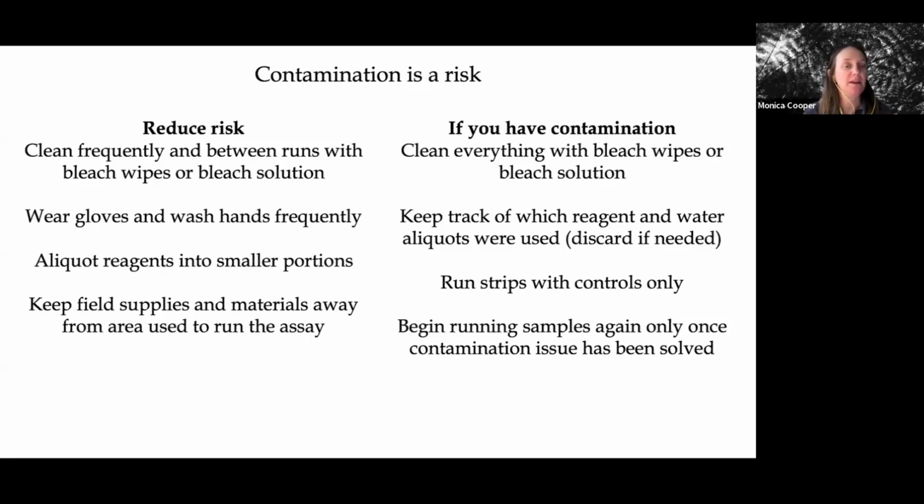We're taking our reagents and aliquoting them into smaller portions, so that if you do have contamination, you don't lose a large portion of your reagent, you only lose that small aliquot. And as I mentioned, we also keep anything that we use out in the field for collecting the samples away from the area where we run the assay.